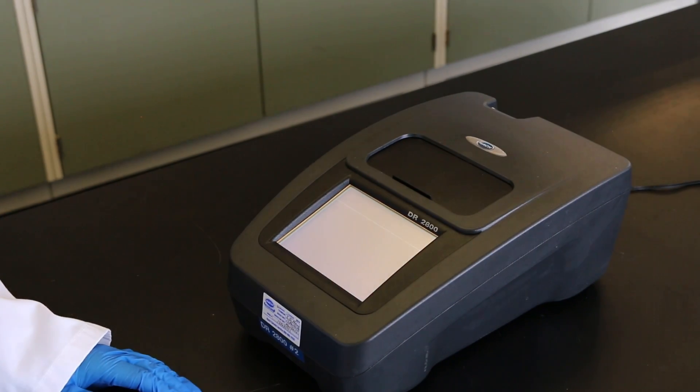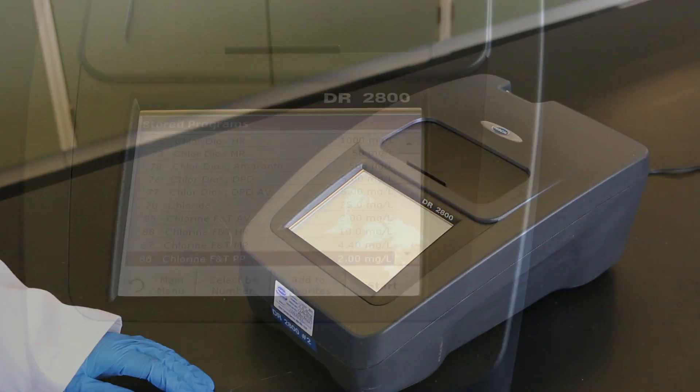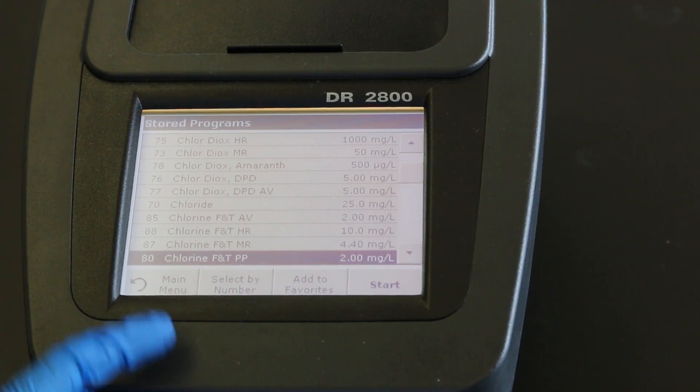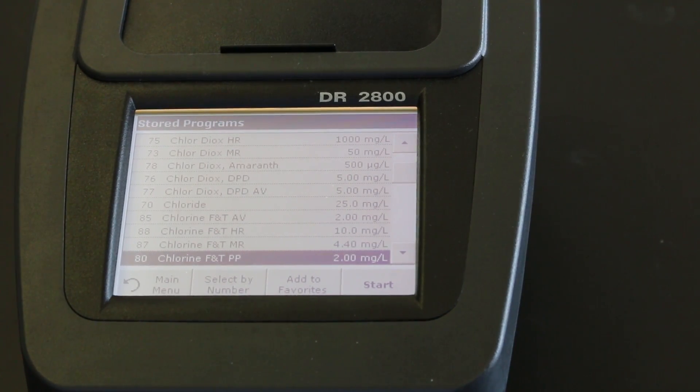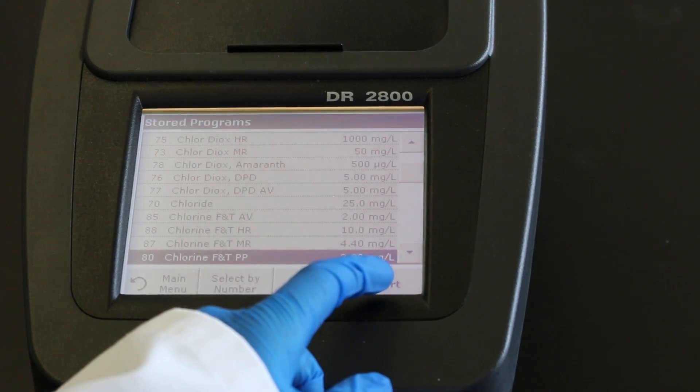Power on the instrument. If the instrument you are using is capable of analyzing multiple parameters, select the correct program for the method that you are using.